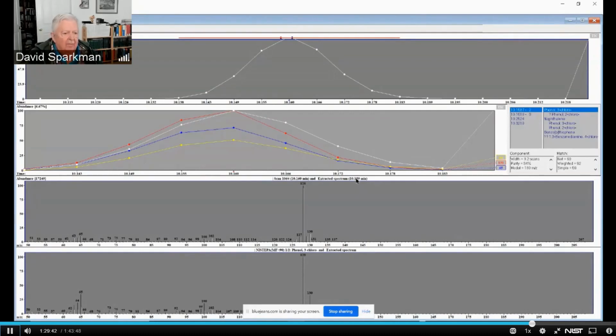So that gives you an idea of some of the various applications of NIST that you can use. Now, Jim and I only look at gas chromatography mass spectral data today using NIST. We immediately open the file, we run the automatic deconvolution, and we take the components from it for identification.